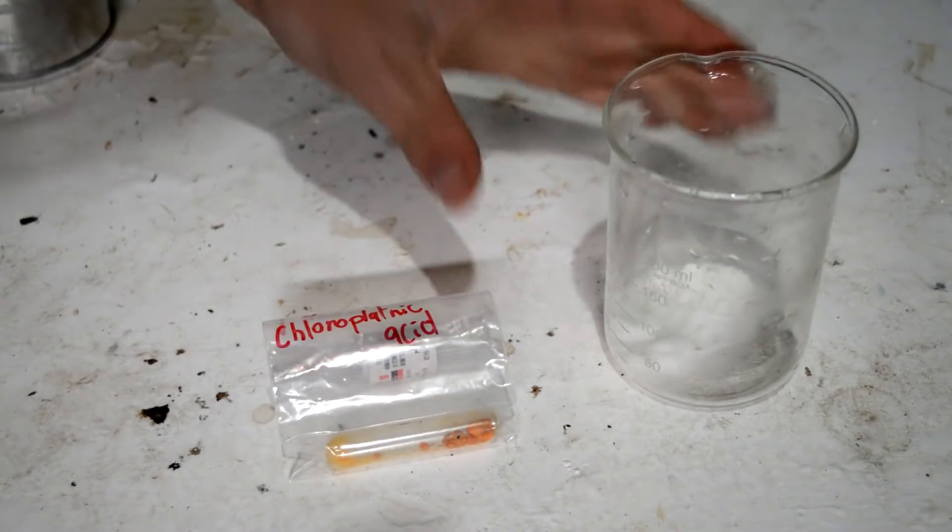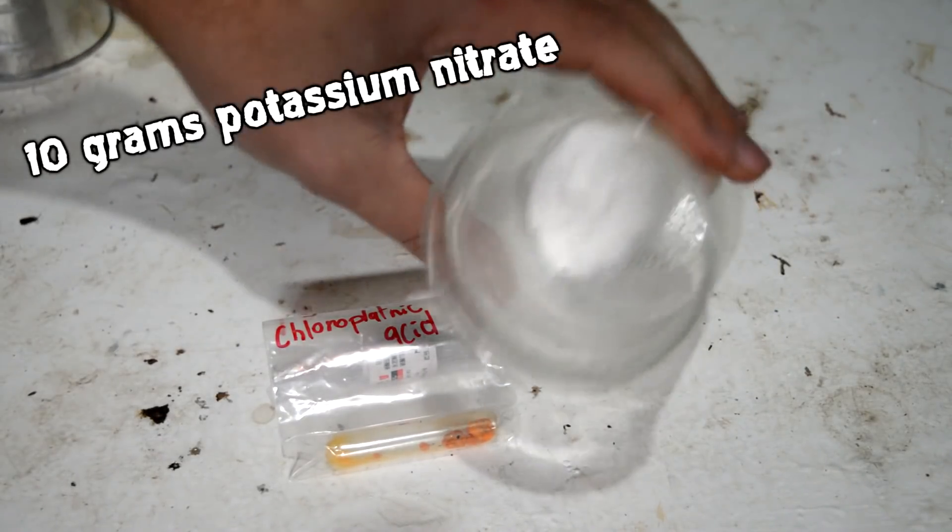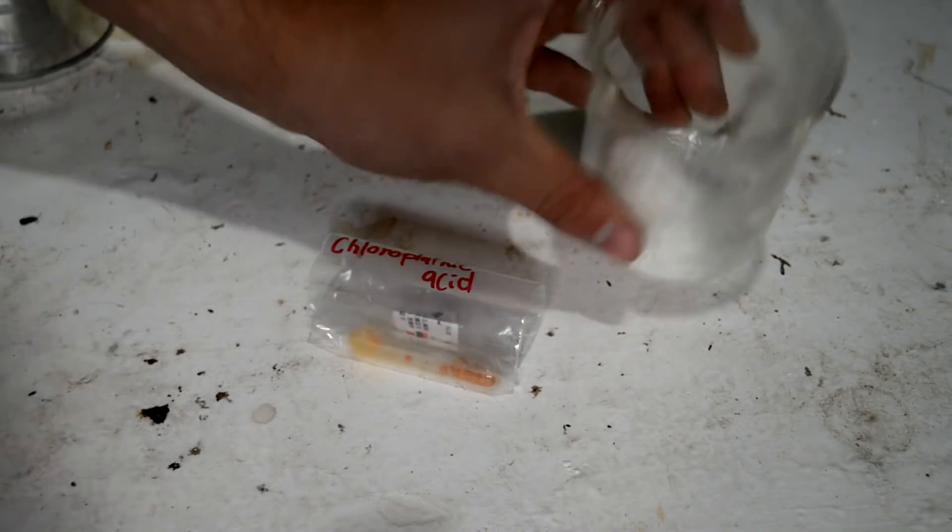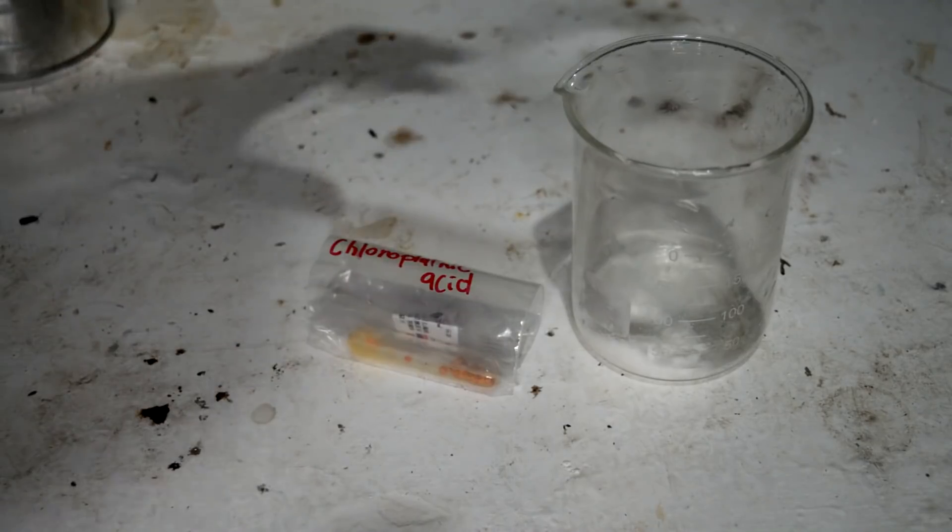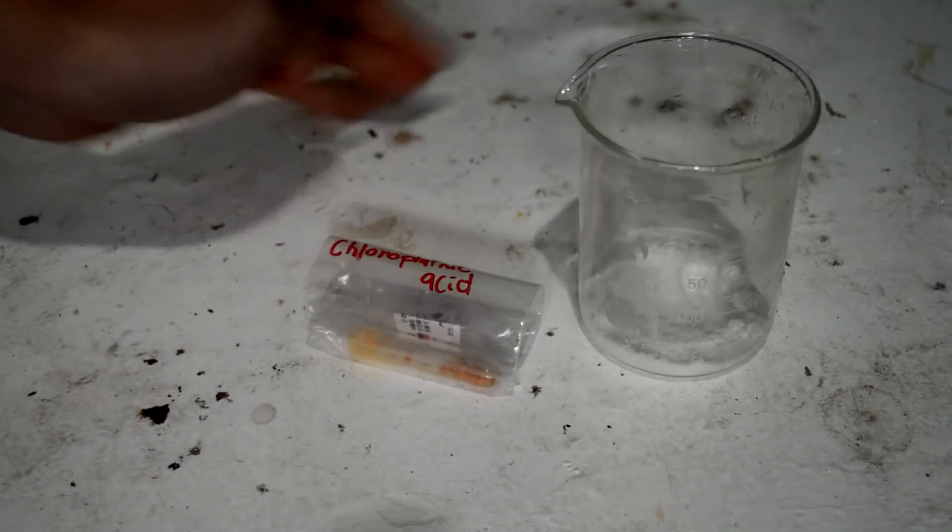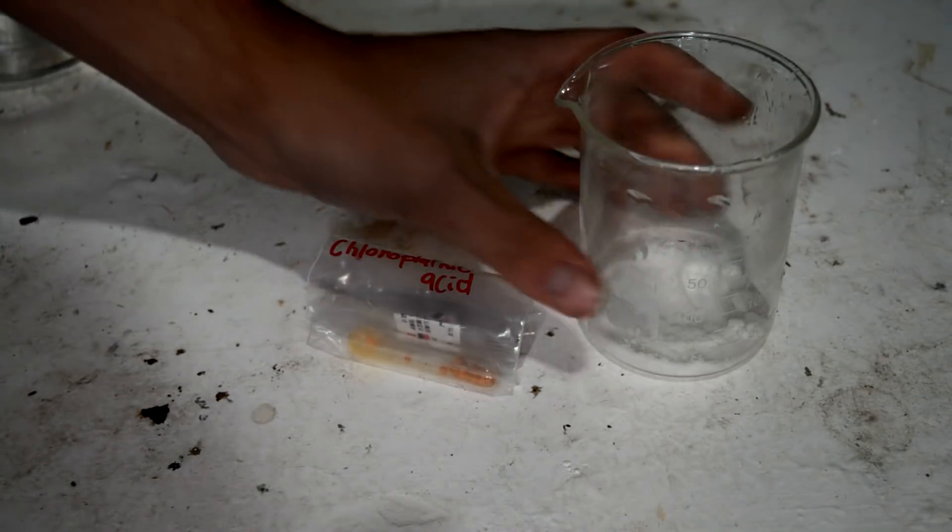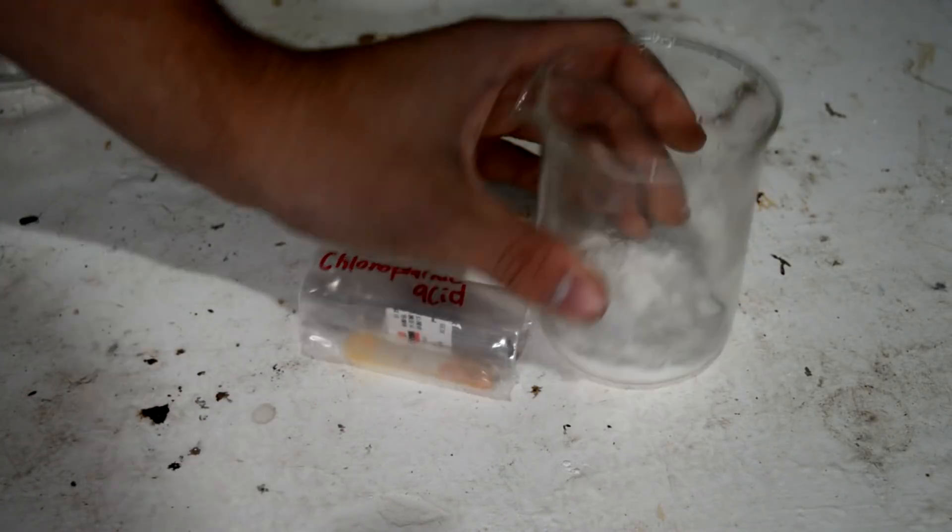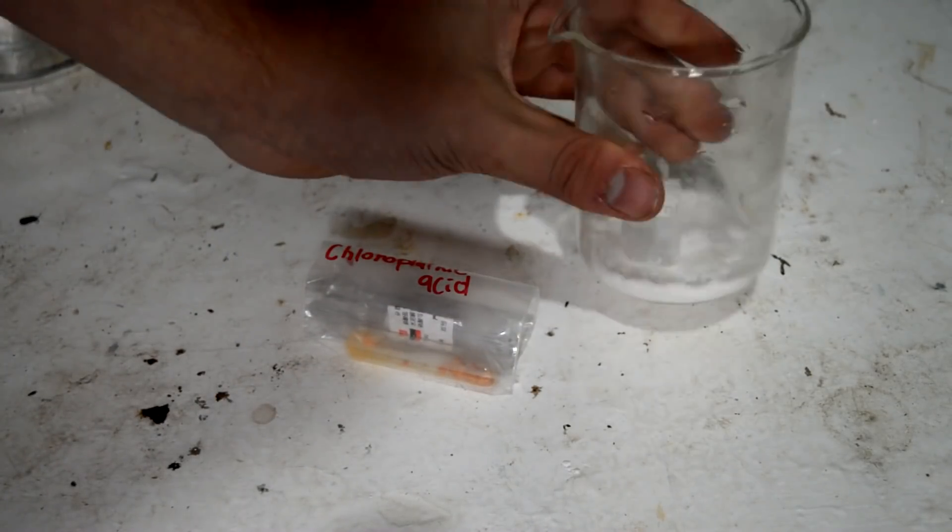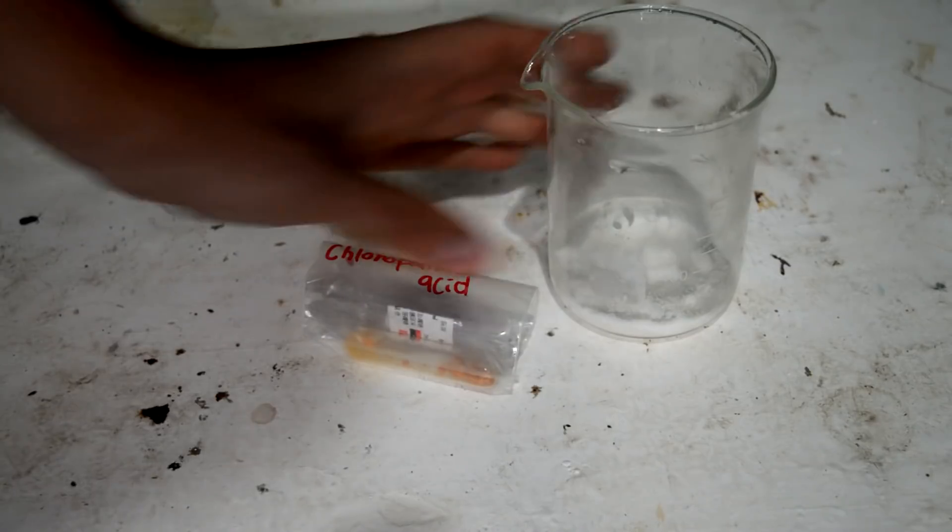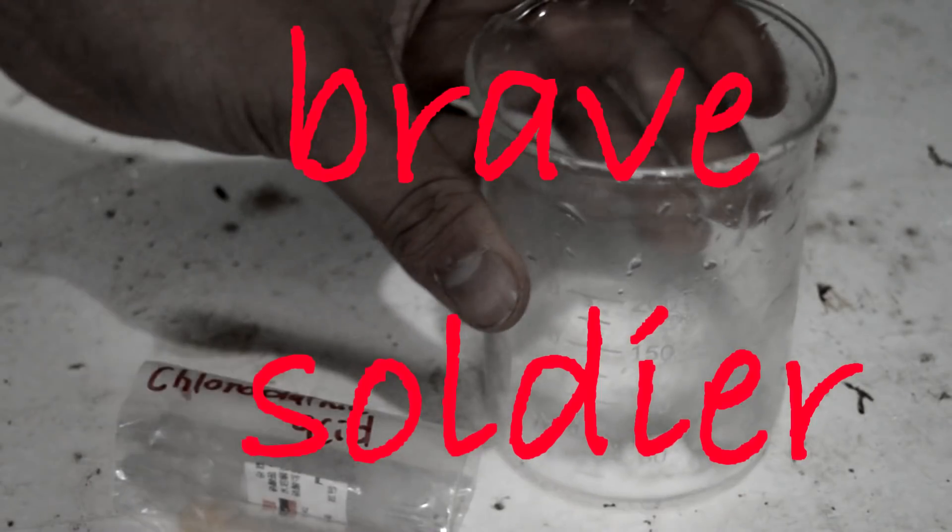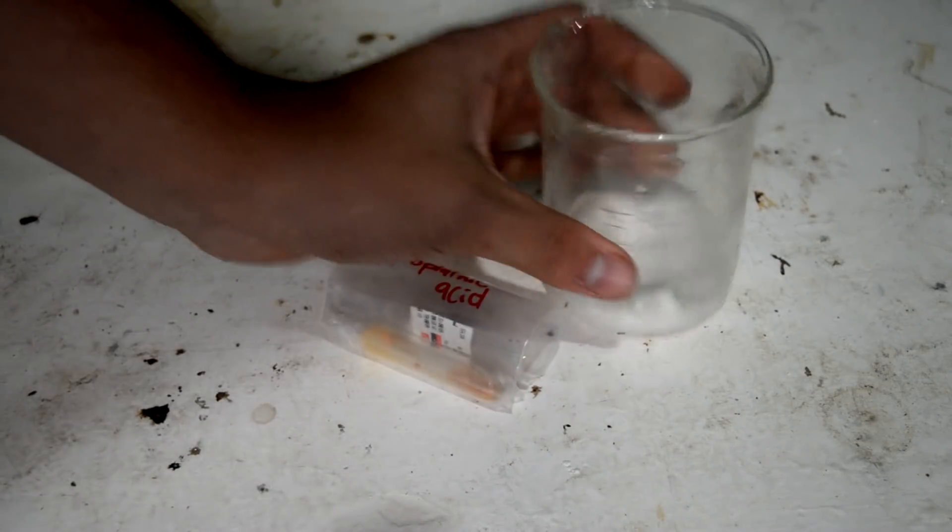So our reactant for this is pretty basic. Here we have 10 grams of potassium nitrate and we're just going to put our one gram of chloroplatinic acid with the 10 grams of potassium nitrate and heat the ever living shit out of it until we get our nice platinum oxide. Sounds easy, but it might practically be hard because the temperatures are quite high.